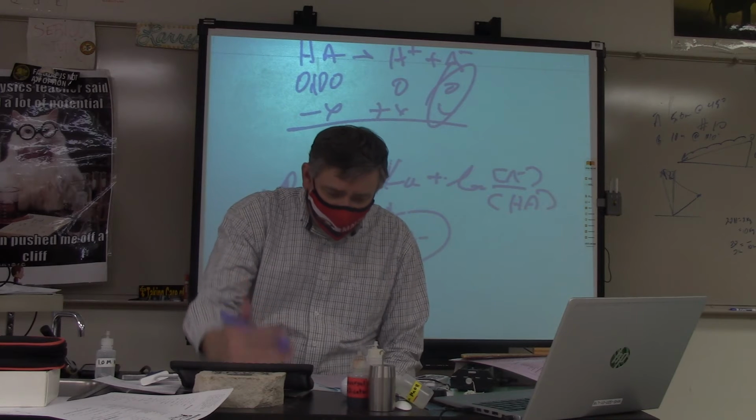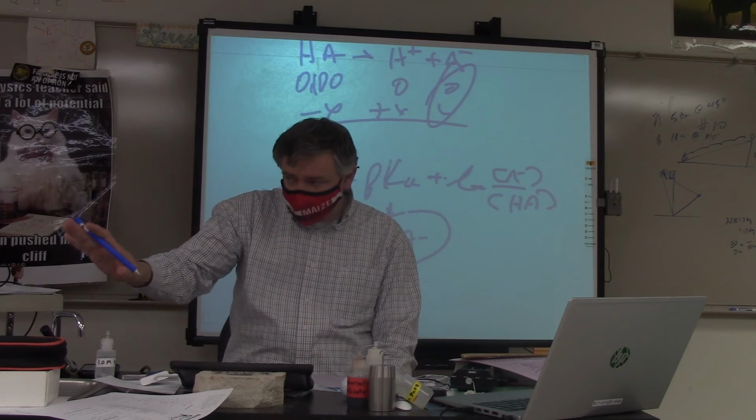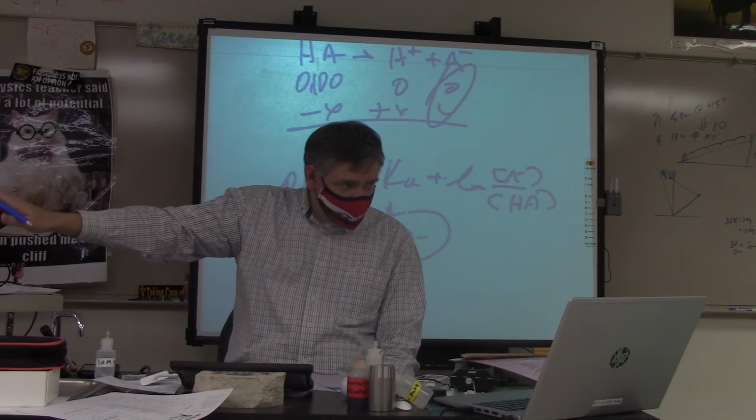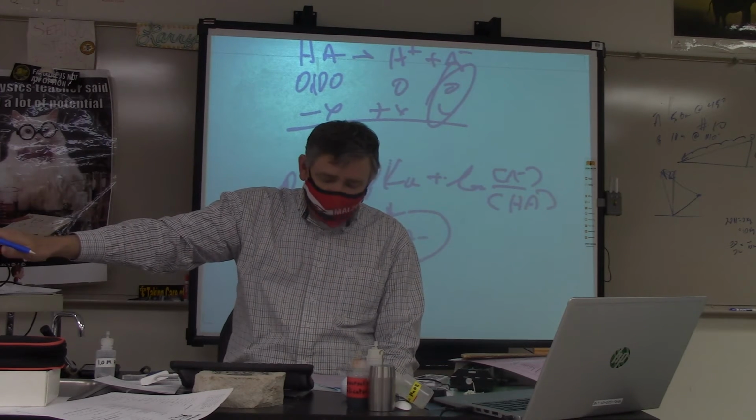And I'll tell you now, on number 11, just in case this goes south, okay, which has been known to happen depending upon the quality of the water we're getting out of the DI system.